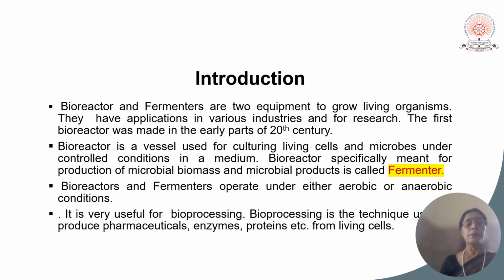Bioreactors and fermenters are two equipments which are used for research purposes or industrial production of certain products. They have several applications and they are industrially very significant instruments.